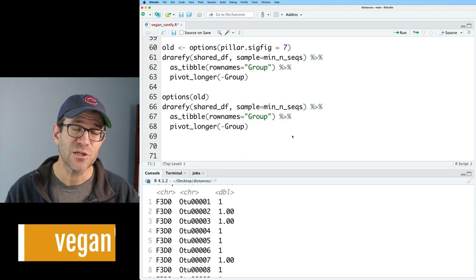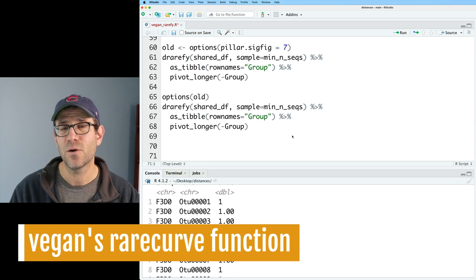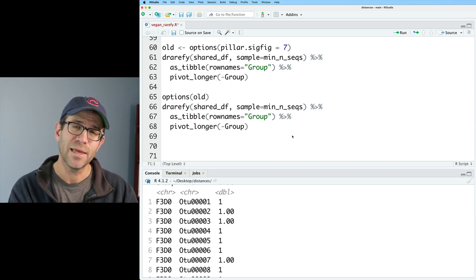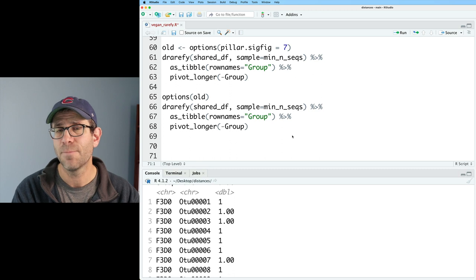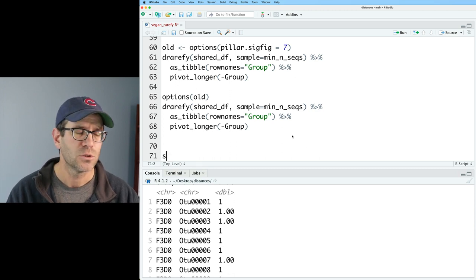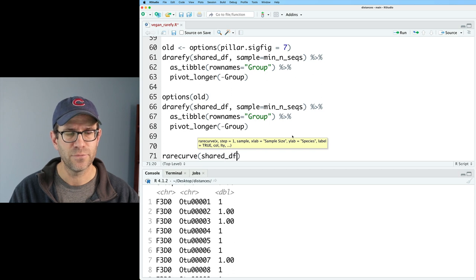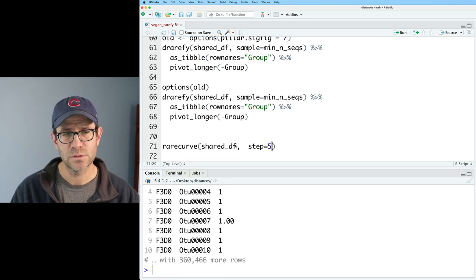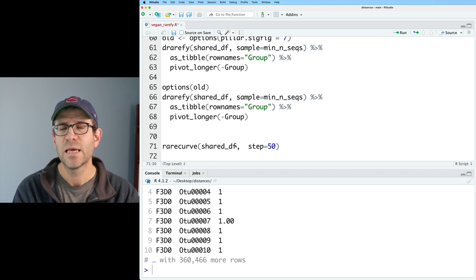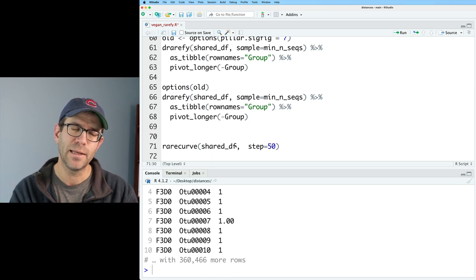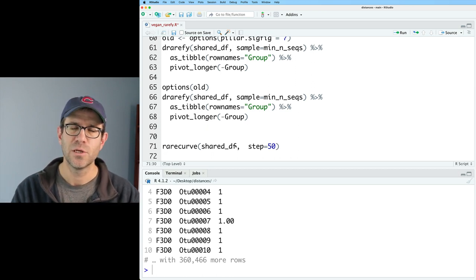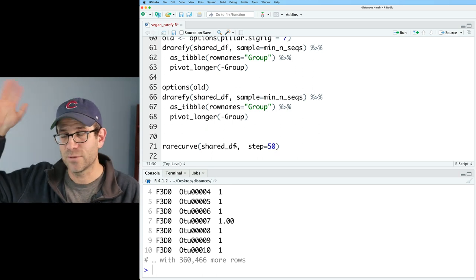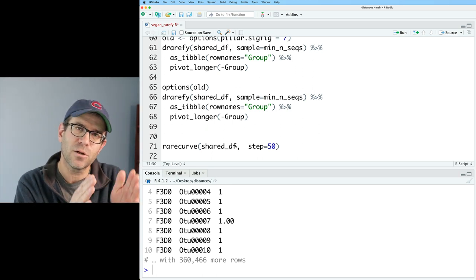So the last function I want to spend time talking with you today about is rarecurve. Rarecurve will take in our shared_df data frame and make rarefaction curves. So we could do rarecurve, and then I can give that shared_df, and then I can say step equals 50. And so what step equals 50 does is it says only output the data every 50 observations. So I don't need to see 1, 2, 3, 4, 5, 6, 7, 8, 9, all the way up to like 10 or 20,000. Instead, it'll go 1, 51, 101, 151, right? You know, we might even go up to 100. Let's do that.